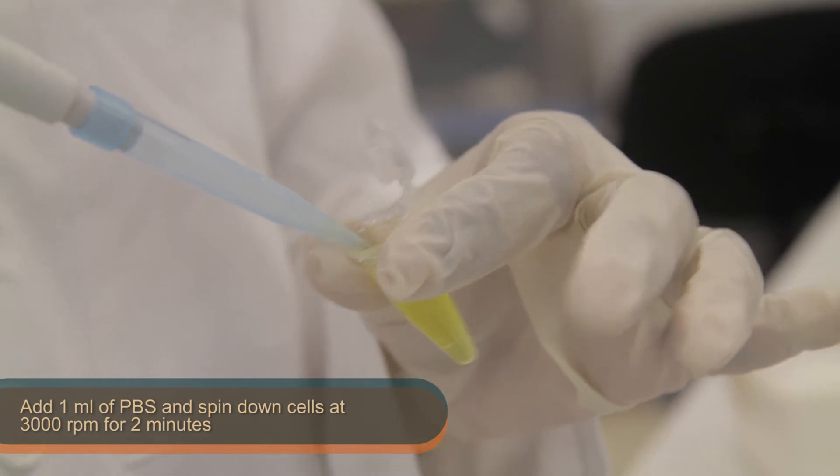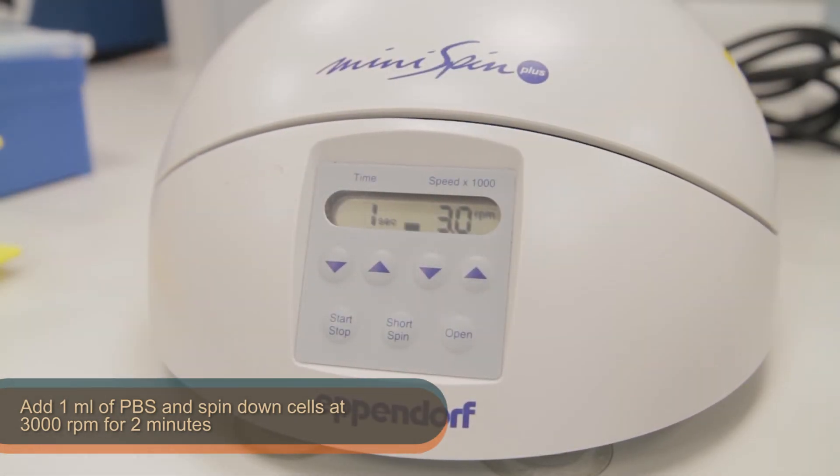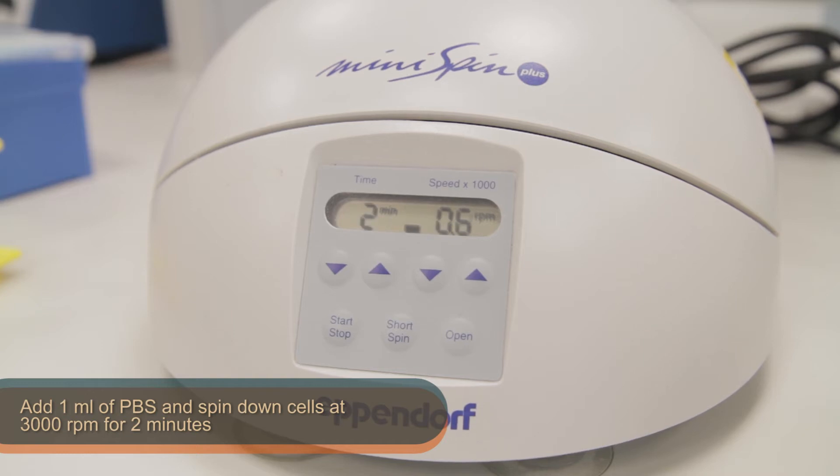Next, add 1 ml of PBS and spin down the cells at 3000 rpm for 2 minutes.